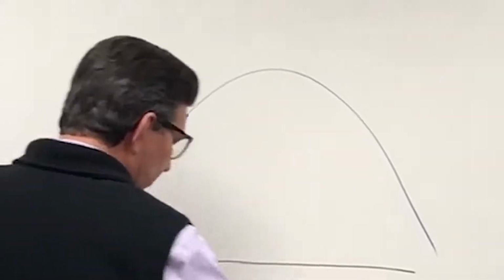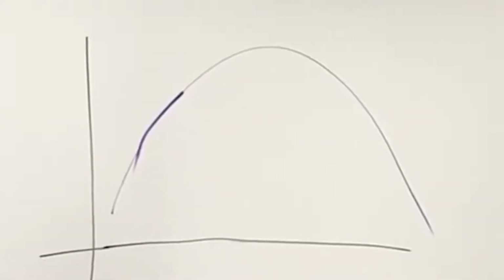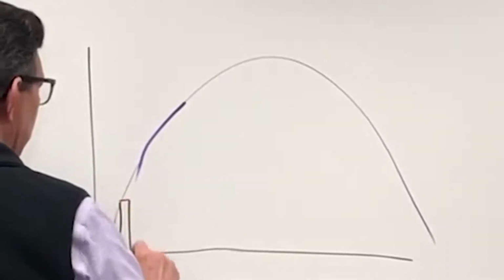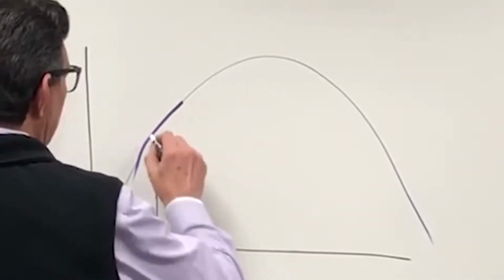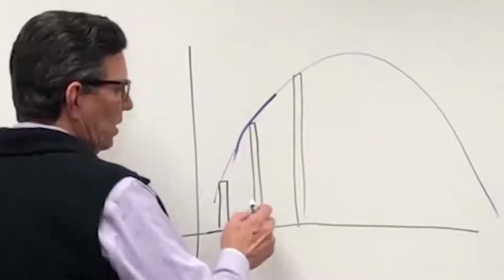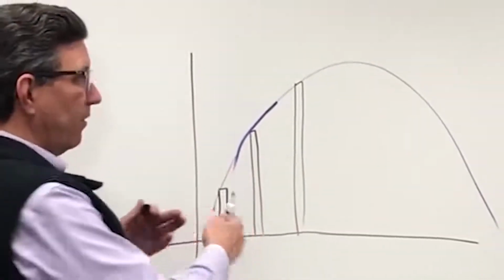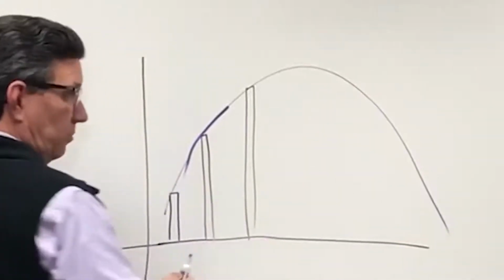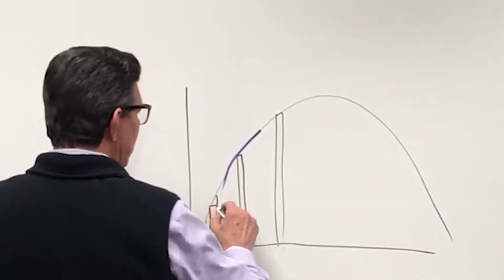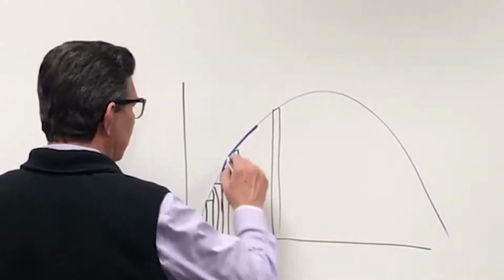So what if there's some other sample mechanisms out there on the market that kind of work like this. They'll take a sample here, and then sometime later they take a sample here, and sometime later they take a sample here. And while I'm getting a lot of samples, and when I aggregate these samples together, I get a fairly representative idea of what was in the line. But what if I took a sample like this, that I kept taking these small samples, right?